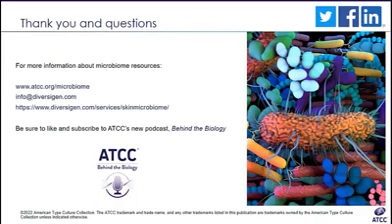Okay, and this question actually sounds like a couple of questions that have come in: are the current skin and other microbiome mock communities sufficient regarding the complexity and diversity of organisms? Yeah, that's a very important question. I would say in terms of the mock communities, there is really no one-size-fits-all solution for developing mock communities in general for microbiome research, including, of course, skin microbiome.